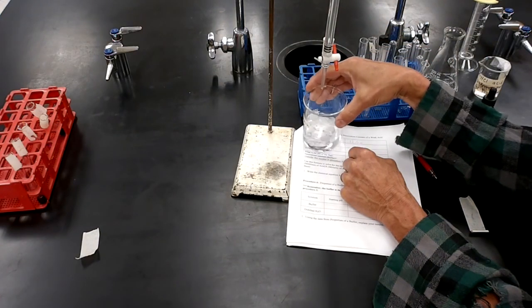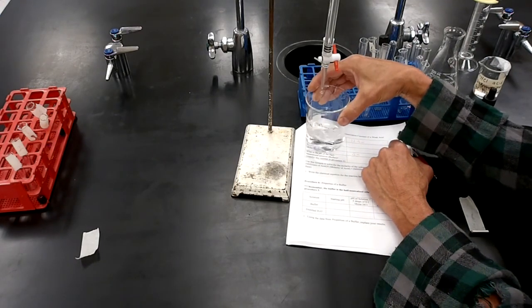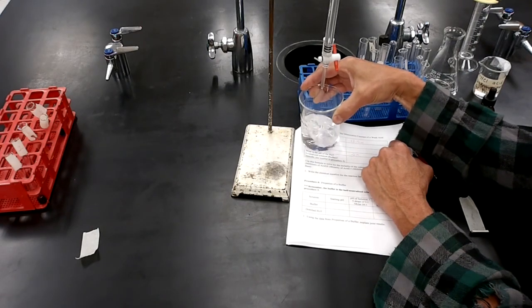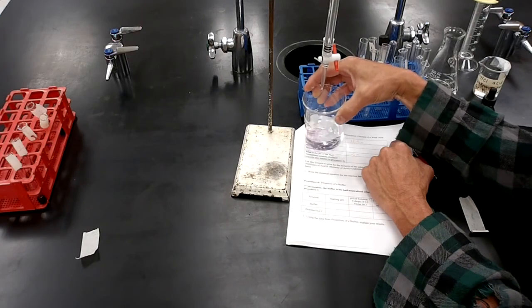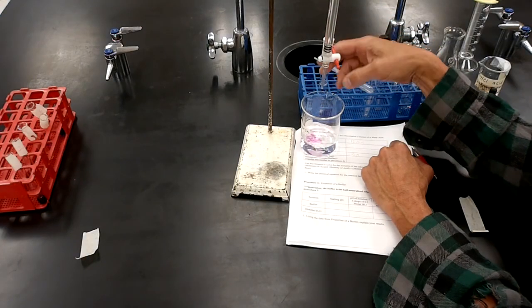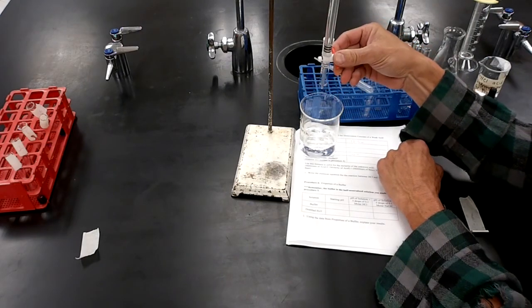So I'll use a pretty slow drop rate. Swirl it a bit to keep it mixed. It's still clear.